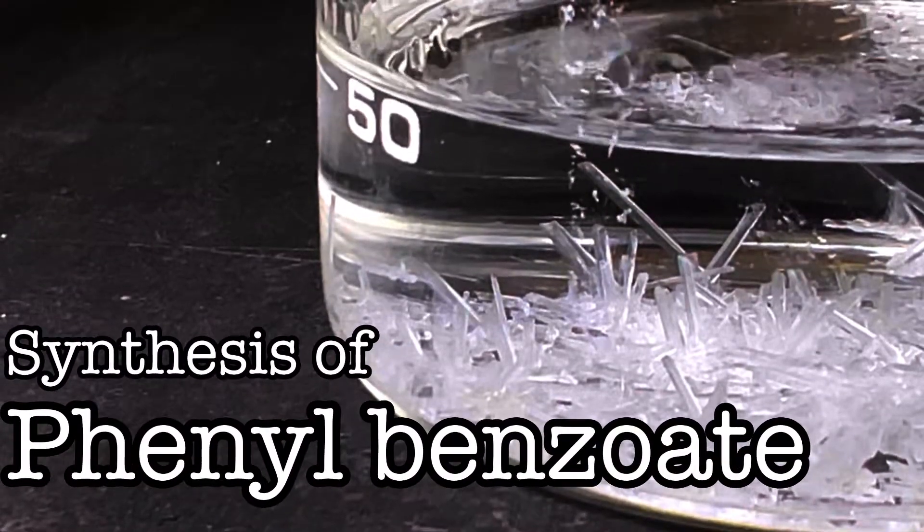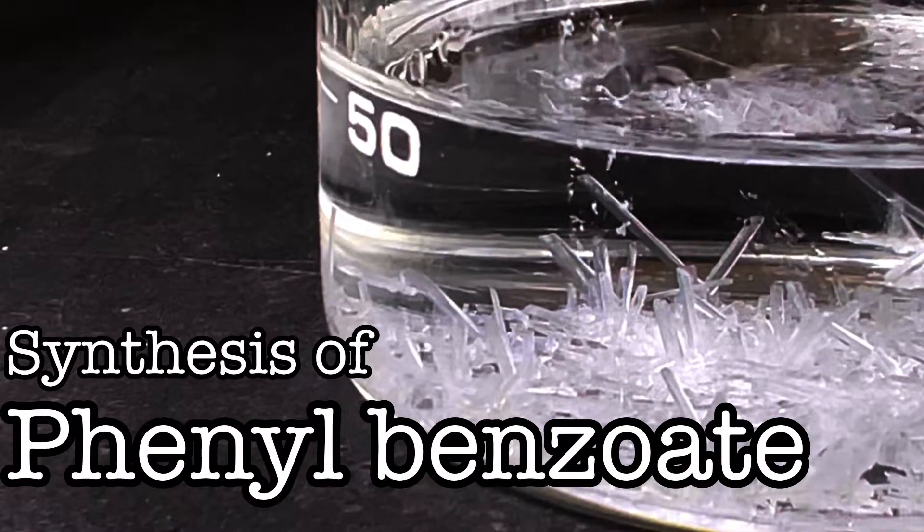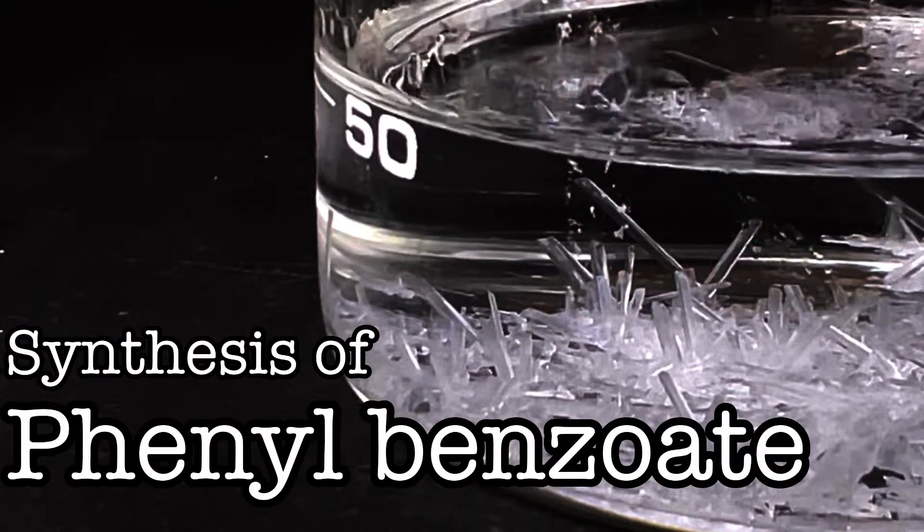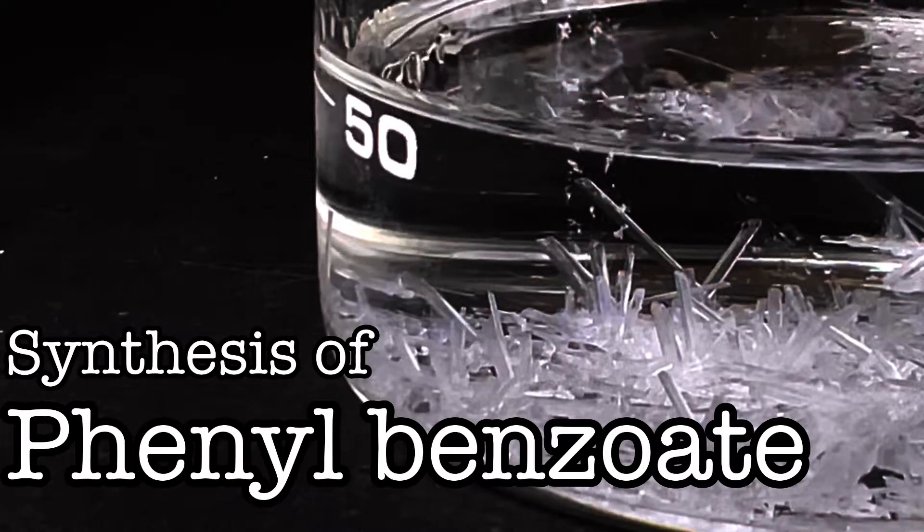Hello friends, in this video we will be synthesizing phenyl benzoate via the Schotten-Baumann benzoylation reaction.